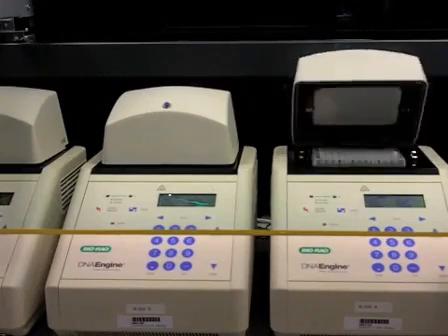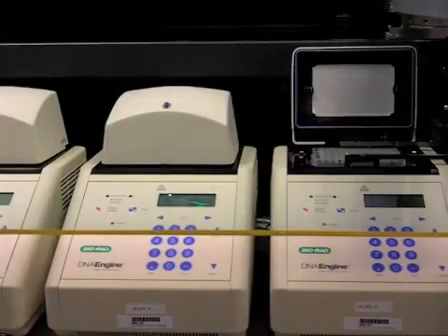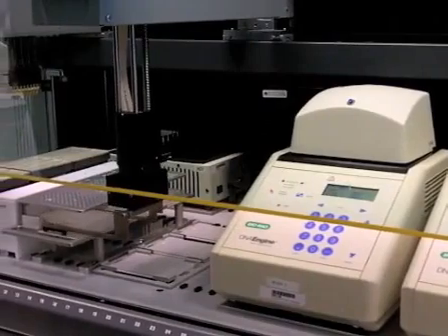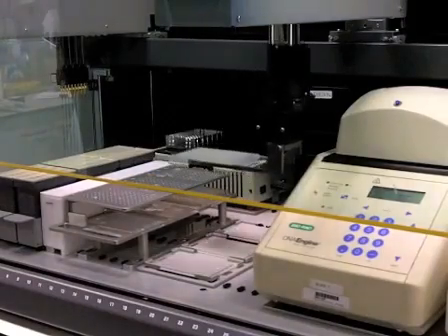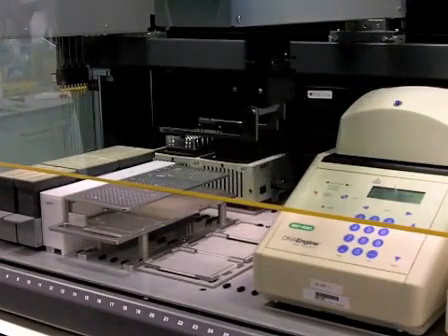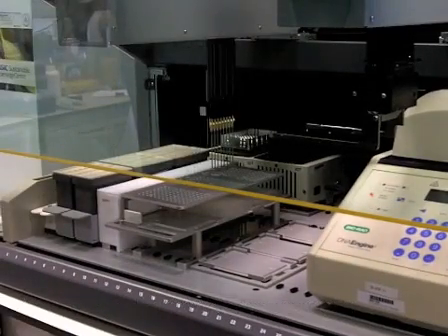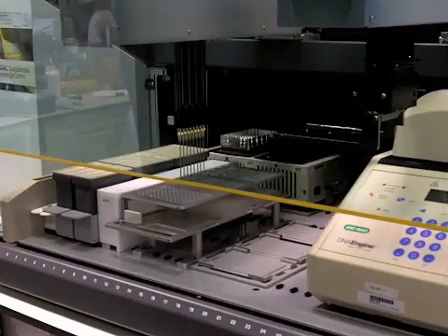After incubation, the PCR plates are removed from the thermocycler. 100 microliters oxidizing reagent is added to the transferred reaction mix to facilitate color development.